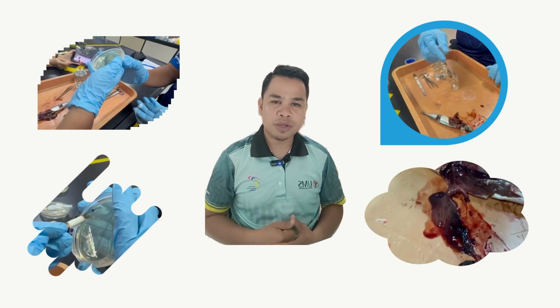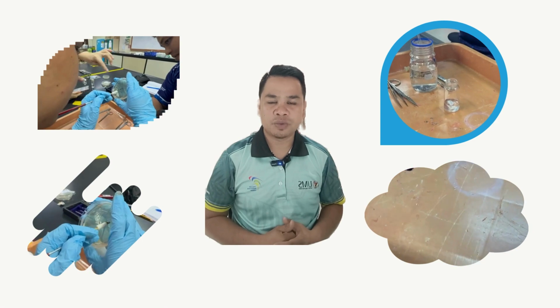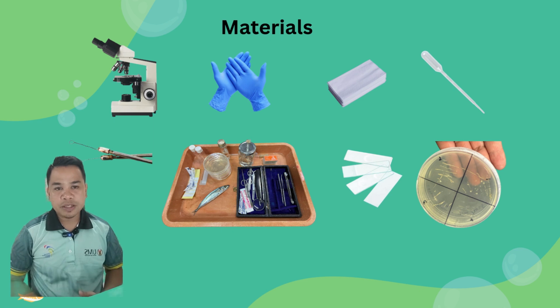Today we will be doing Practical class 1 regarding fish dissection to detect the presence of bacteria. The materials used are fish, gloves, tissue, dissecting tray, ethanol 70%, ethanol 99%, Bunsen burner, water, dropper, microscope, glass slide, cover slip, media agar, and inoculation loop.